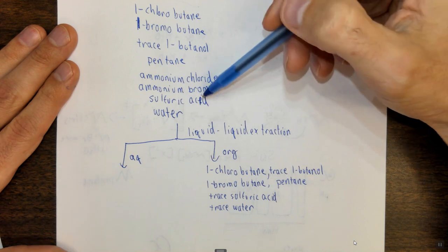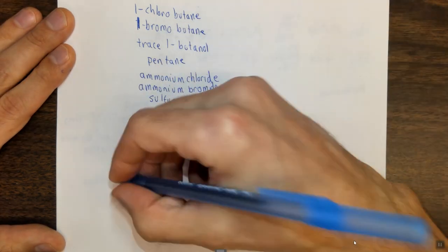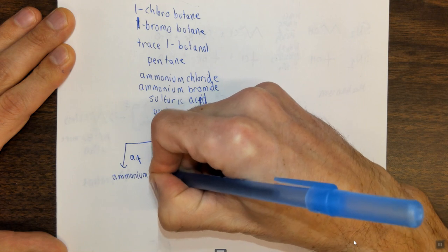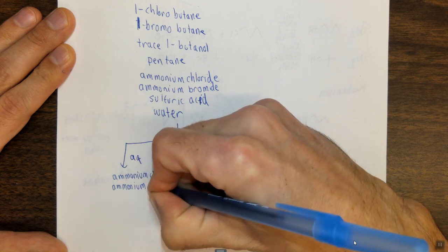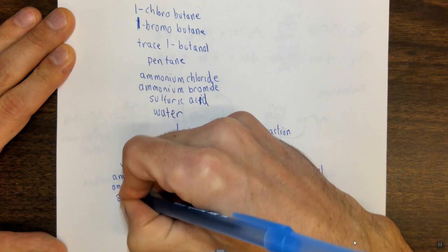What about in the aqueous layer? Well, in the aqueous layer, you're going to have your ionic compounds. Your ammonium chloride, your ammonium bromide, your sulfuric acid.